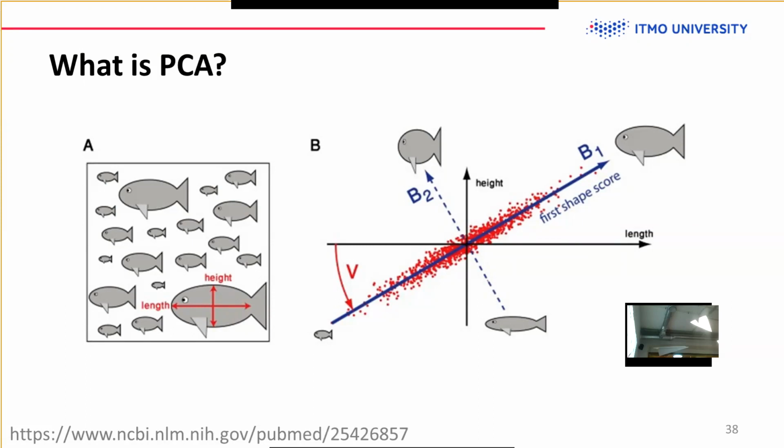This can be answered with principal component analysis, which tries to find the axis in your data that would explain your data set in the most compact, linear way. So basically now we can say that if you know length, we more or less know height. If you know height, we more or less know length, but there is some noise or variation that we can't really tell.